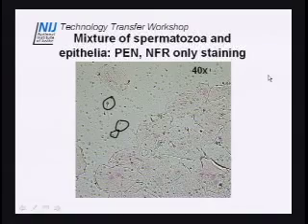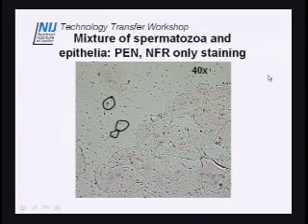But another thing I want to point out about the slide, this is not a Christmas tree stained slide. And Christine's going to go into this more when she gives her research presentation. She did a lot of staining studies that I did not do. I actually took this from her, and some of that had to do with the DNA typing downstream. What I do with these slides is just a quick 2 to 3 minute staining with the nuclear fast red, and that's it. I rinse it off and go. Because with the green, she thinks that it inhibits PCR, because it's an acid.